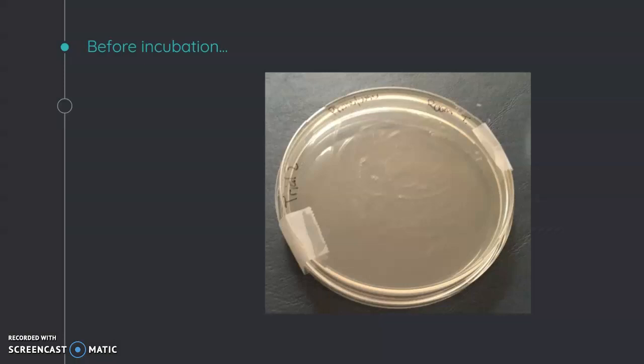Here is an agar plate that has been streaked with bacteria. As you can see, the streak marks are faint but visible. However, there are no visible bacteria. After we streak the bacteria, we have to give them a chance to grow. At this point, they are still individual microscopic bacterial cells. But under the right conditions, the bacteria will grow and form colonies, or circular groups of many bacterial cells. Bacterial colonies are visible to the naked eye.